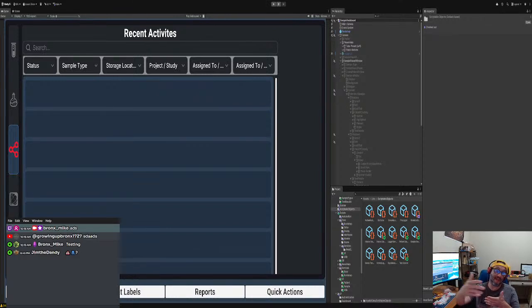I mean, we should extend that ideal to the scenes as well. Okay. Verify test results async. I believe this just makes sure that it verifies that final, boom boom boom, somebody verified it. Okay, all right, so now we got this done, it's working, and let's see how it works, right?